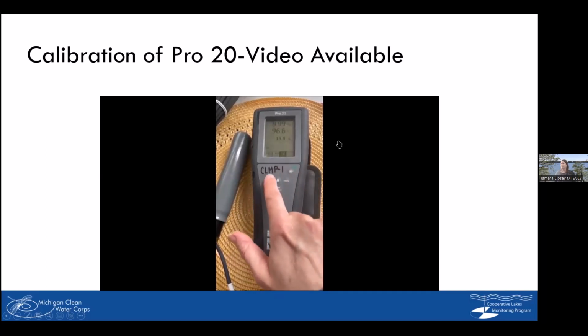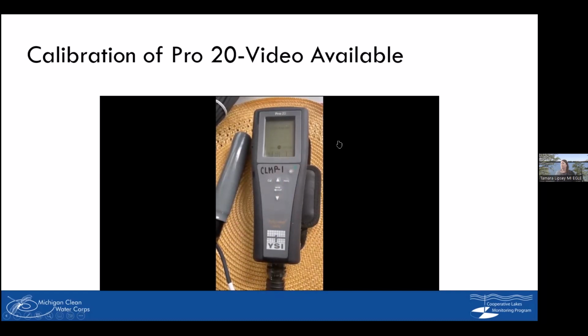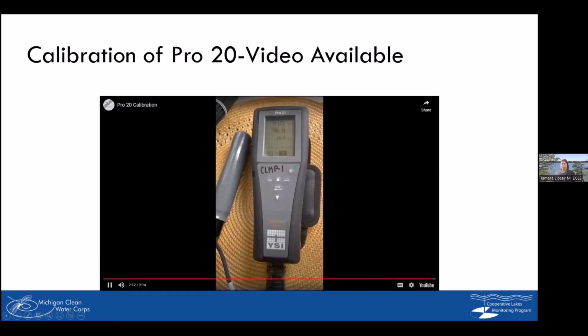But if you wanted to double check, all you do is hit calibration again, hold it, calibration successful, and you're ready to go. Have fun.